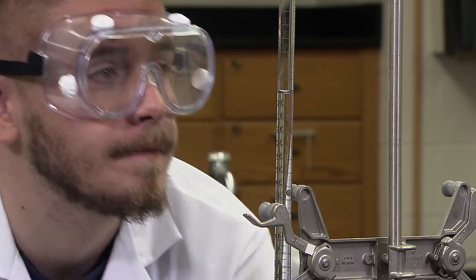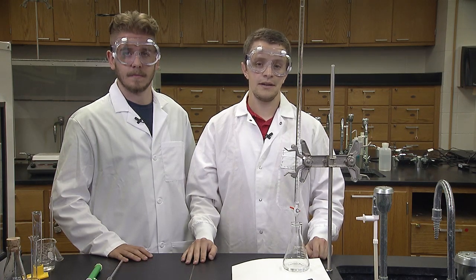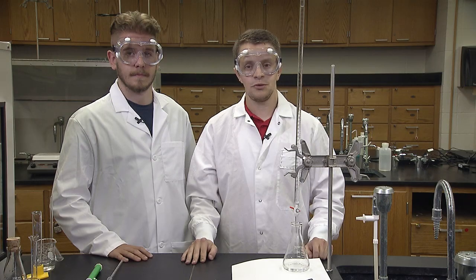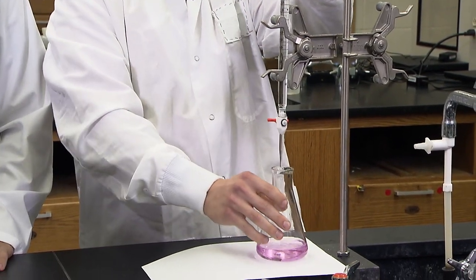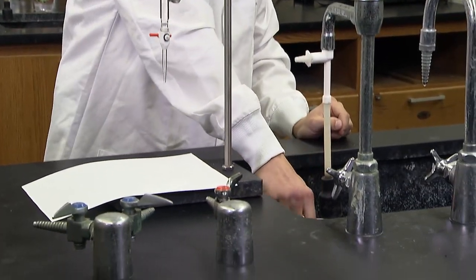I see 29.08 milliliters. Always record two decimals even when the meniscus is touching a line. If it does touch a line, just record .00 for the decimals. The flask can be emptied down the drain and cleaned to prepare for the next trial.